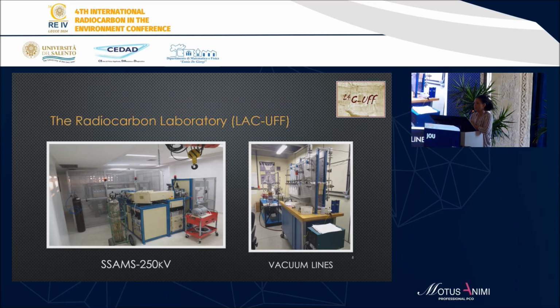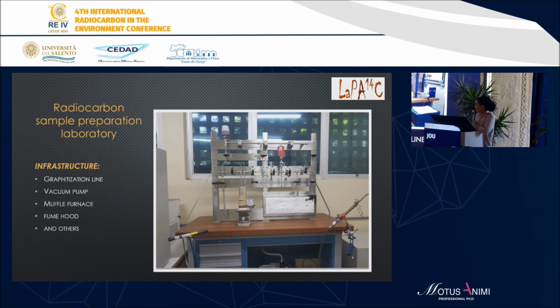In these two photos of LAC UFF, we have a sample preparation lab and a single stage AMS. And this is a photo of LAPAC, the new radiocarbon lab in Bahia, another state in Brazil.